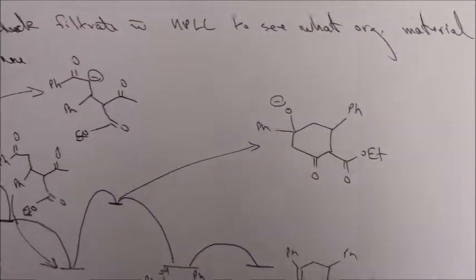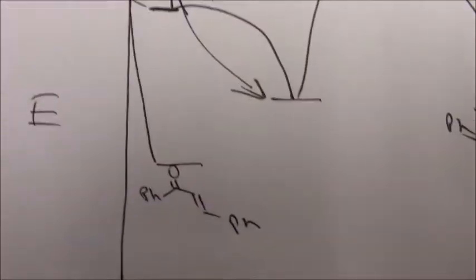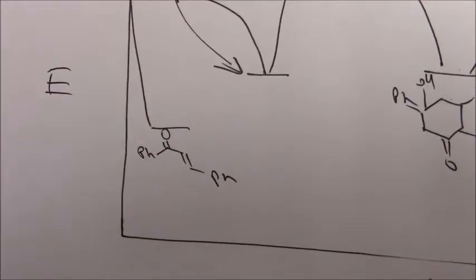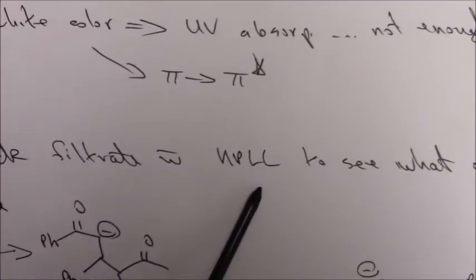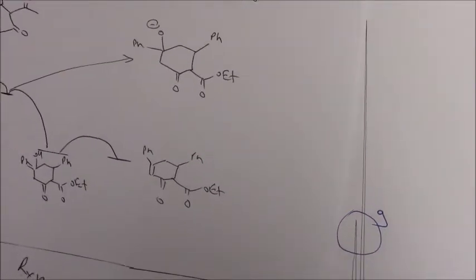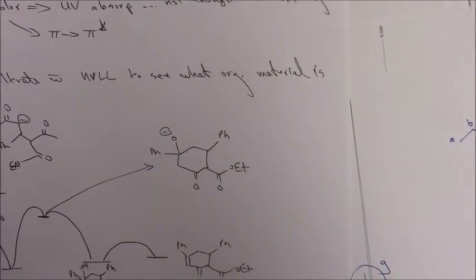And the other thing too is for yield, our starting material, most of us use it as crude from the previous one. So whatever mass you think you're weighing out for the starting material is not really accurate with what was actually there in terms of moles of starting material when you put it in the reaction itself. And there does not seem to be any evidence of leftover starting material when I ran it. So yet again, HPLC would be needed to clarify that. This is just the rough touching on what your discussion could be like. But that'll do it for number 8.